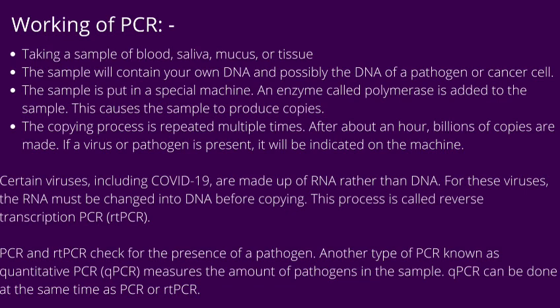The copying process is repeated multiple times. After about an hour, billions of copies are made. If a virus or a pathogen is present, it will be indicated on the machine.